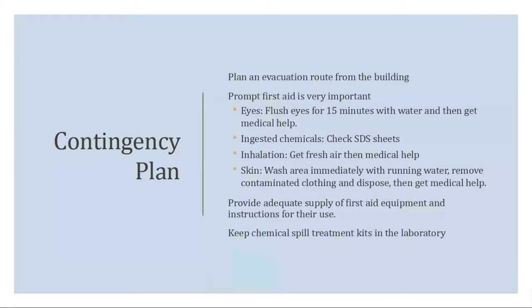Skin, wash the areas immediately. Remove the contaminated clothing. Yes, if a bottle explodes and you happen to get it all over your body, we do have a shower, and when you shower, you don't shower with the contaminated clothing on. You will take everything off, shower, dispose of the clothing. It's a case of safety more than it is image.